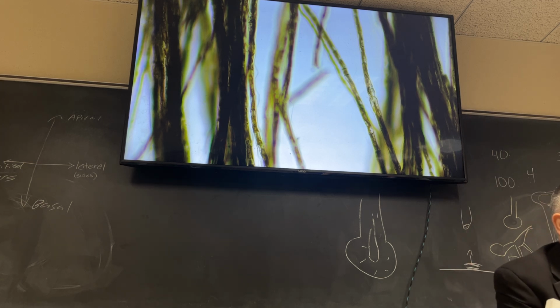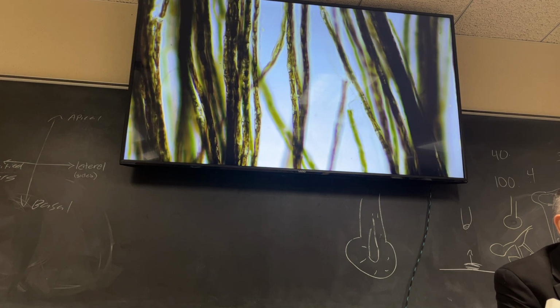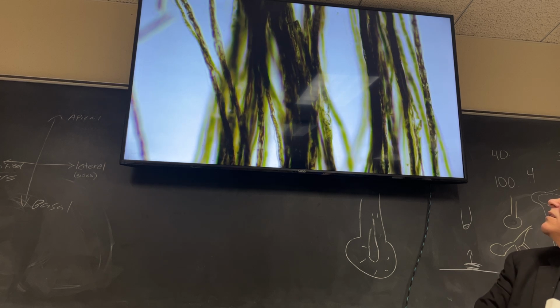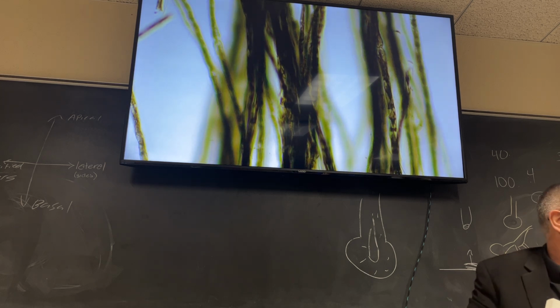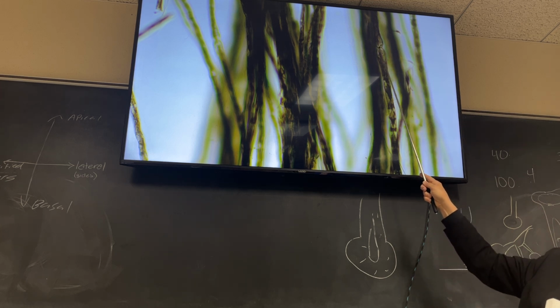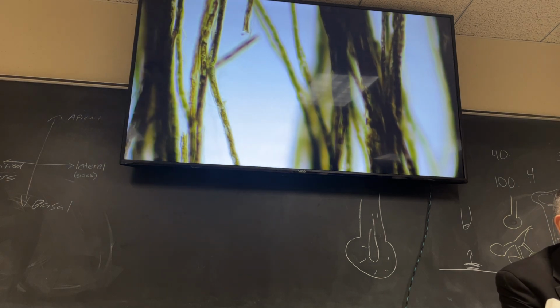Let me see if I can show you another node. Nodes are fairly easy to see and they're kind of the fun part of it, right? Let's see, how about that one? Yep, you can barely see it, but right here. And those nodes have no myelin connecting. The spot that doesn't have any myelin is not very big, it's kind of in between them.